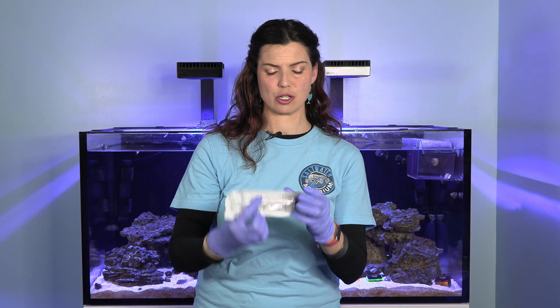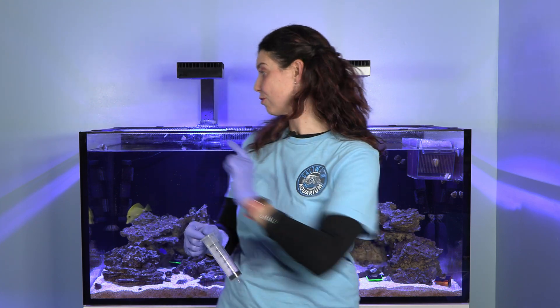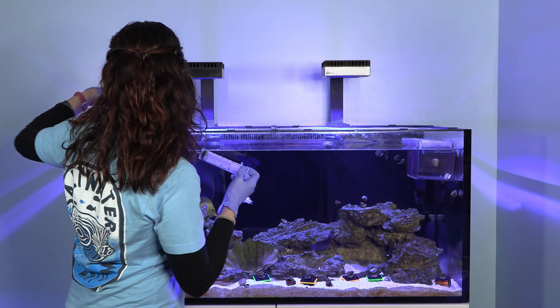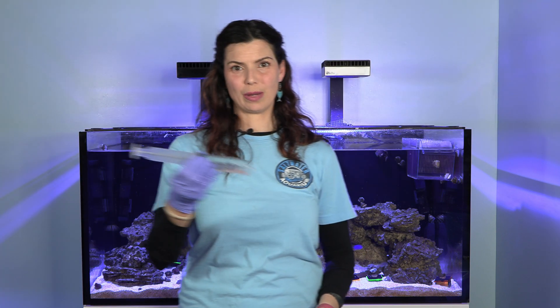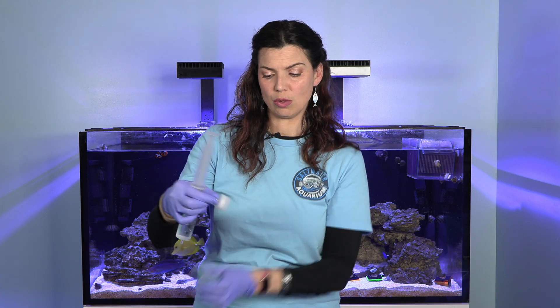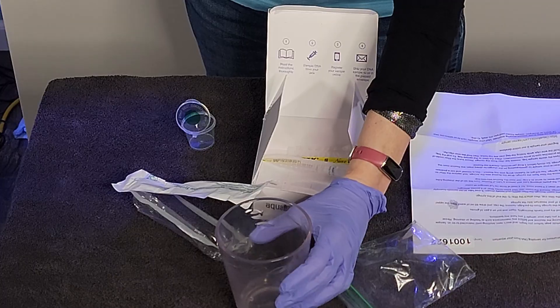The next thing on the instructions is to go ahead and pull out the pair of gloves and put them on. Now that I've got my gloves on, we need to remove the syringe. Using our syringe, I'm going to get a sample of water from the top part of the water column in the tank. Now that I have my water in the syringe, I'm going to take my little filter out of this cup. Something that they don't give you in the kit is something to squeeze the water into.